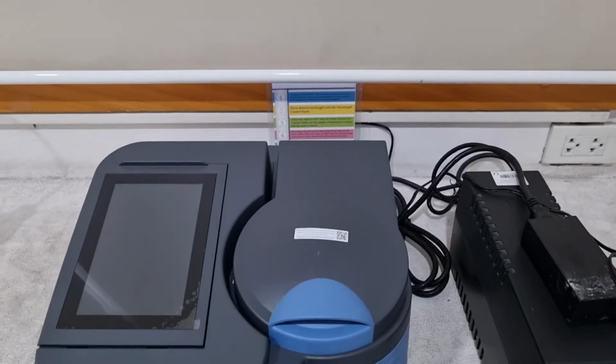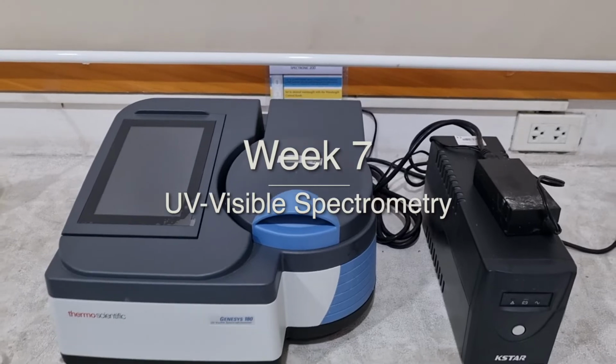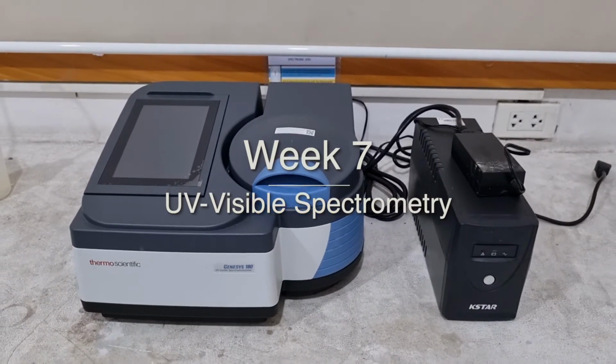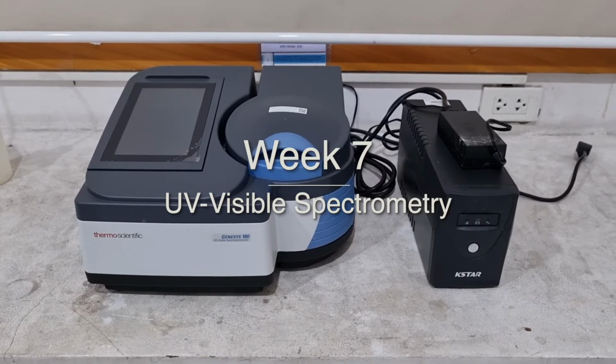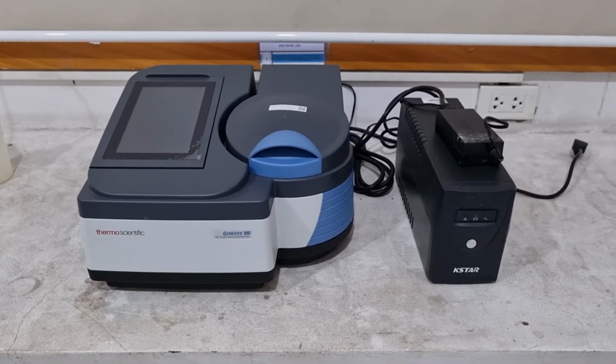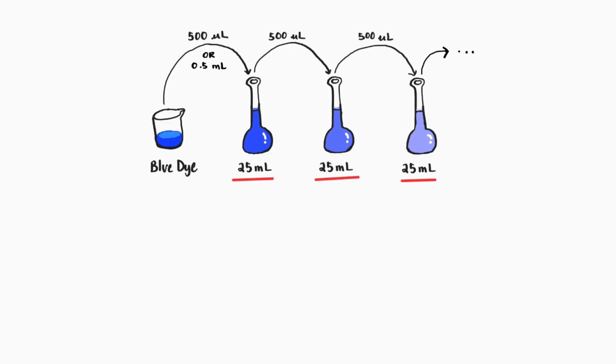Hey chat! In this video, I'll go over how one might do a quantitative analysis using a UV visible spectrometer. This spectrometer uses UV or visible light to do the analysis, so it's very helpful in quantifying colored solutions. For this video, I'll use blue dye as an example. We can reliably do analysis for dilute concentrations of colored solutions.